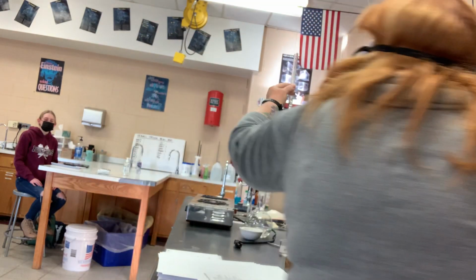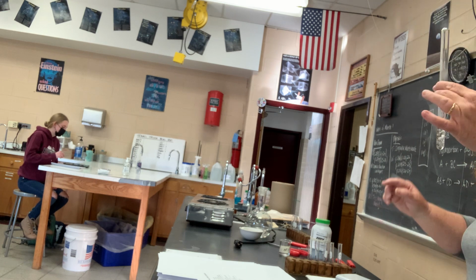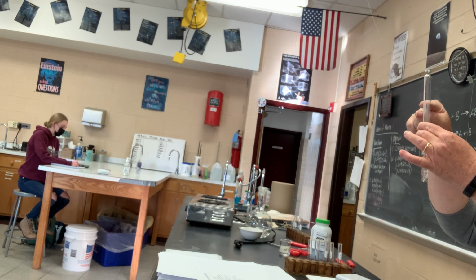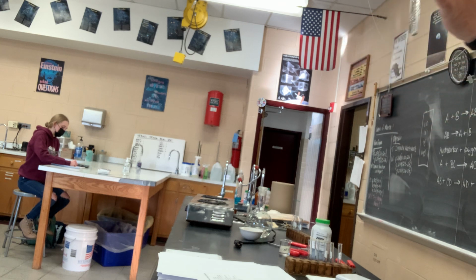Okay, so zinc is reacting with hydrochloric acid. That's one reaction for part C. What I'm doing is trapping the product of the first reaction in the test tube, and then lighting it on fire, which is a second reaction. See if you can figure out what that is. Look, the zinc is going away. Nothing just goes away. It's making something. The zinc went in the hydrochloric acid, single replacement. So the zinc is now with something, and something has been released on its own, and that's what I'm trapping.